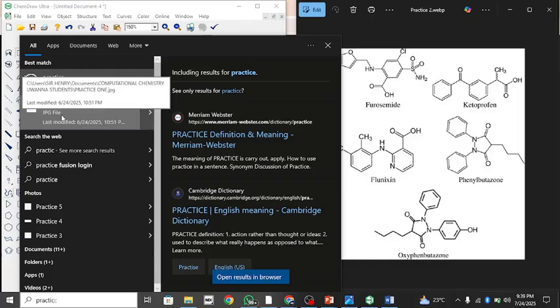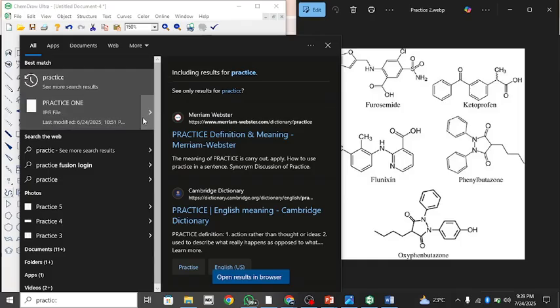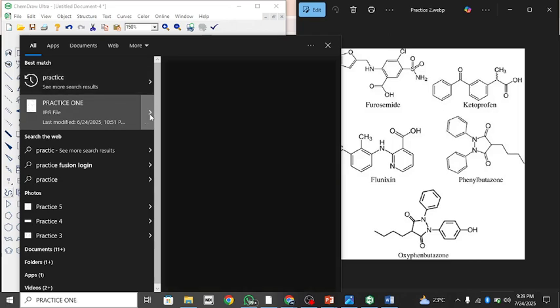So where are you getting this structure? Okay, I downloaded the structures so that you can use them to practice. Where do we get the structure you are trying to share? I sent the structures to you. Some are the ones I have drawn before so that we can use them to practice.